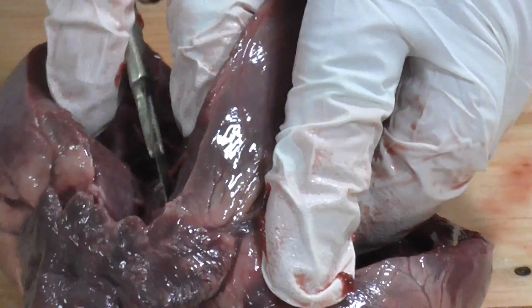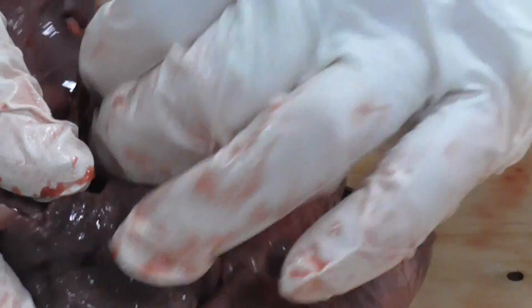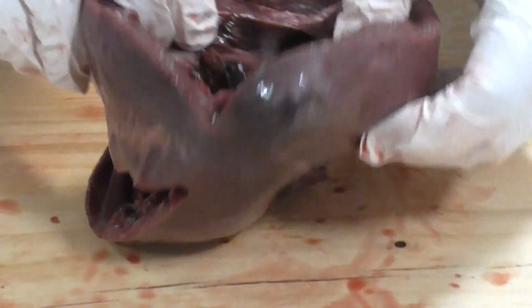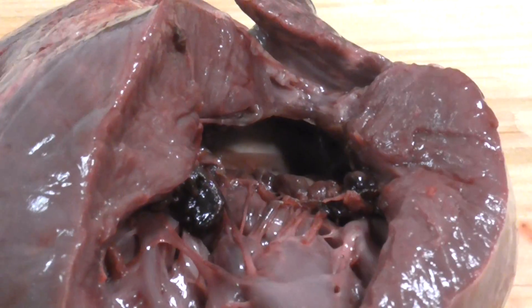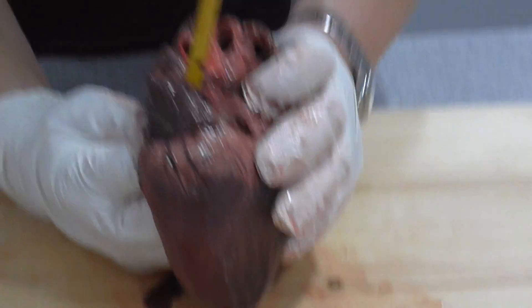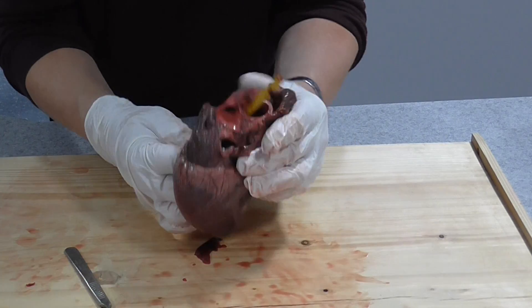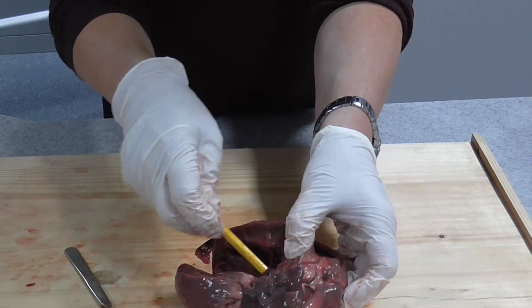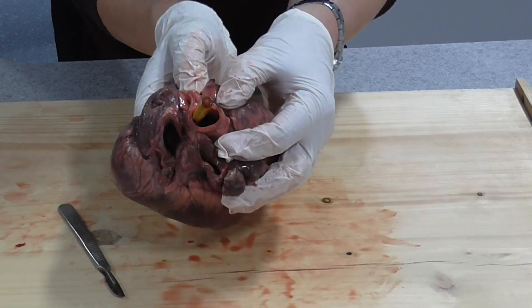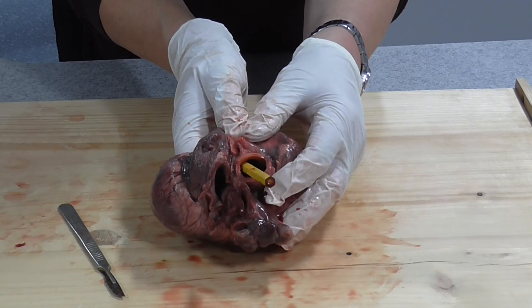We can see the AV valves on the left side - big respect for heart surgeons when I see this. The valves here are somewhat damaged so we won't see much of them. If you look up into the top, you can actually see where the blood vessels are leaving the ventricle. Using a pencil to probe, we have two blood vessels here. Pushing the pencil up through the left ventricle, it comes out the top of the heart - that will be the aorta, the main artery leaving the left ventricle.